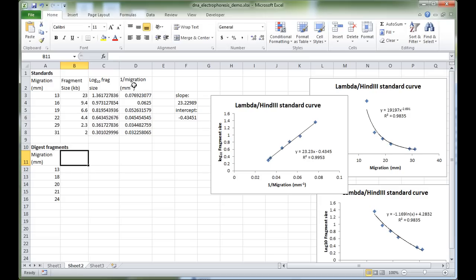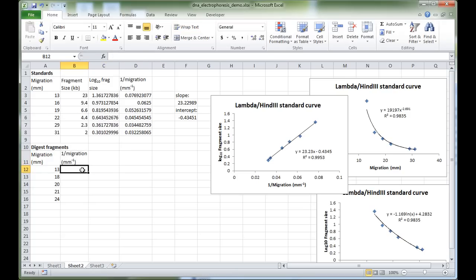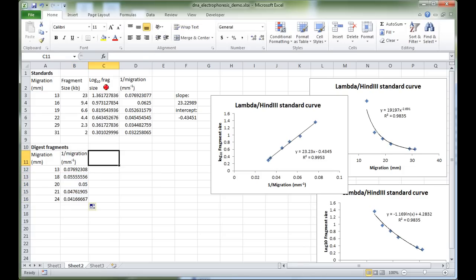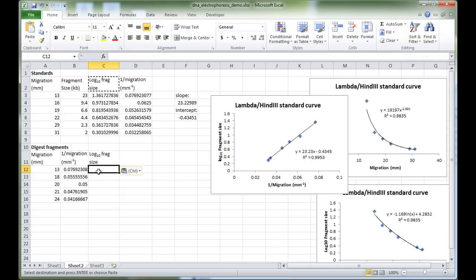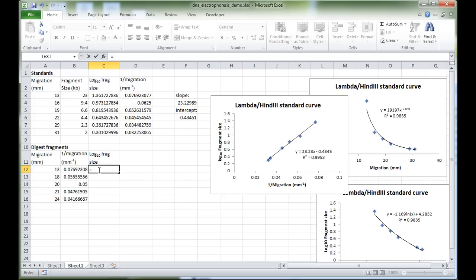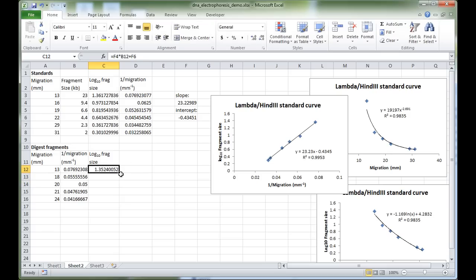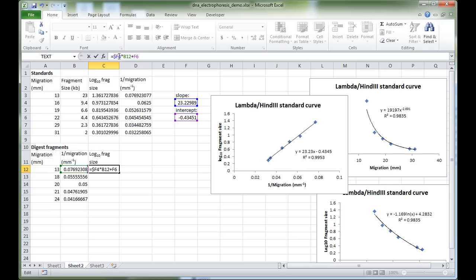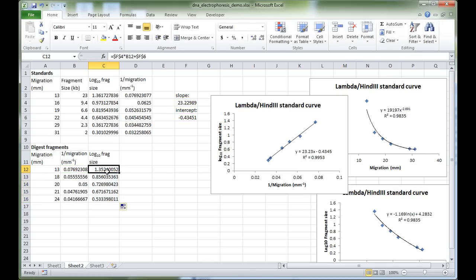First, calculate 1/migration by typing '=1/' divided by the migration cell, press Enter, and drag down. For the log₁₀ fragment size, copy and paste the column header. Since 1/migration is x and log₁₀ fragment size is y, apply the formula y = mx + b: multiply the slope (m) times x, plus the intercept (b). Because we're dragging down, use dollar signs to fix the slope and intercept cell references — for example, $F$4 and $F$6 — press Enter, then drag down to populate all rows.